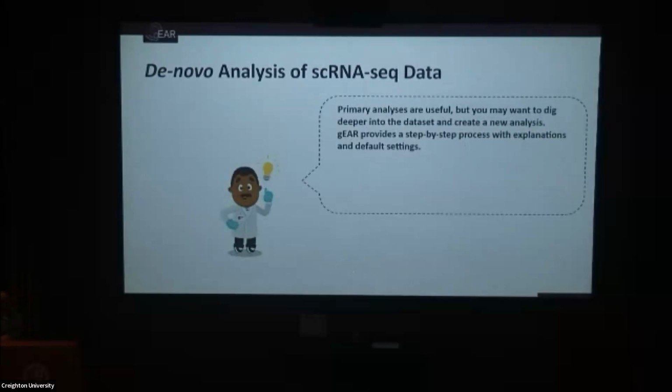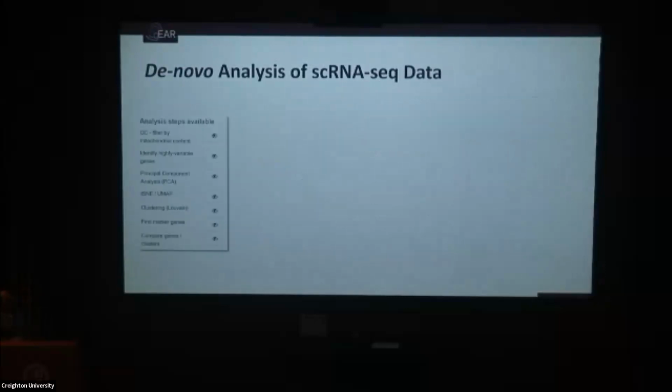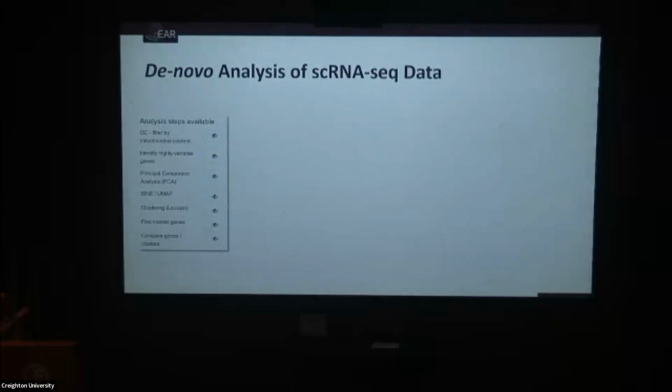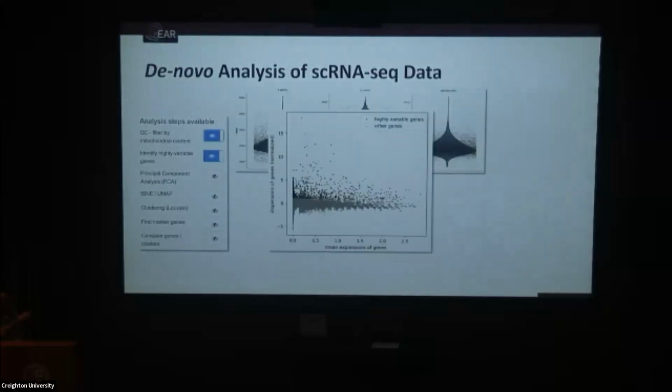If you want instead to do your own full analysis from the beginning, such as if this was your data set you just uploaded, you can do that. The menu on the left shows you the steps. If you click a step, a form will appear and you just answer the questions in it and hit submit, and it computes on the fly. And so on as you go down each step. Each one has graphical results.